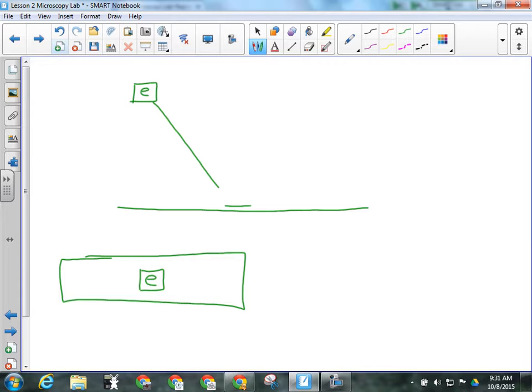So we'll have it on there, and then we put the drop of water on, so we'll have this little bubble of water on the slide. Then we take a little plastic cover slip, which is just a little clear, thin piece of plastic, which incidentally you do need to be a little bit careful with. The edges of it can cut you, just like the edge of paper can cut you. So you set it at an angle like this, and then you drop it on, and it just falls down onto there, squishes the water to the edges, and sticks.